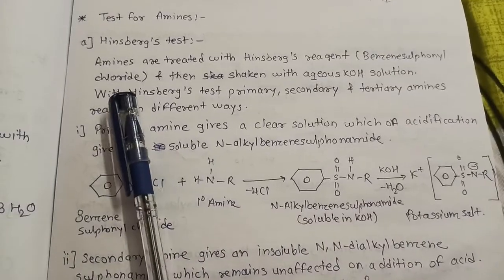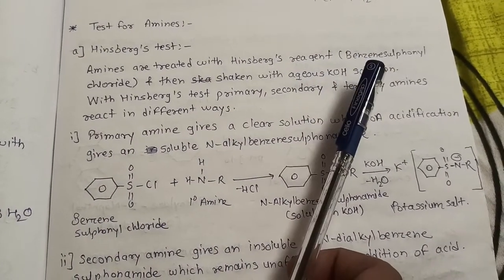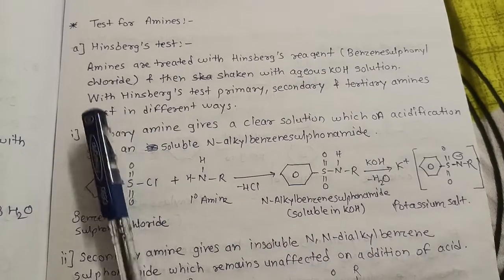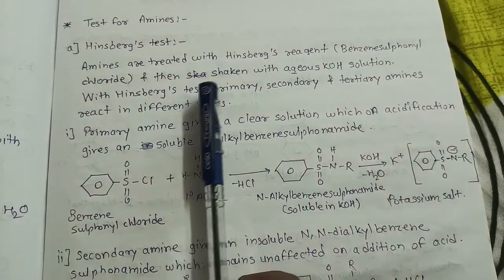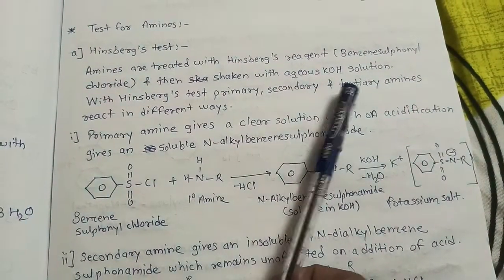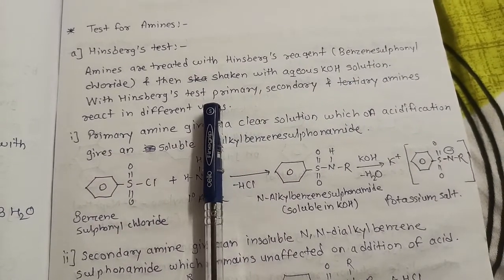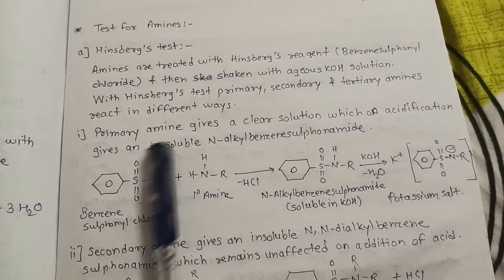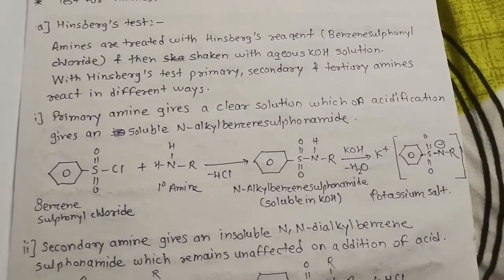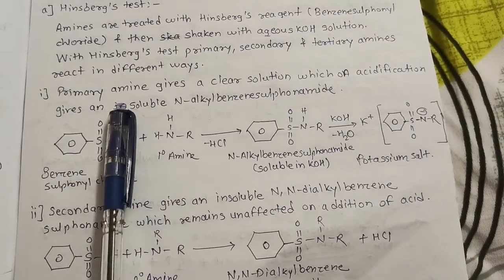In Hinsberg test, amines are treated with Hinsberg reagent. Hinsberg reagent is benzene sulfonyl chloride, and after treating amines with that, it is then shaken with aqueous KOH, which is a strong base. With Hinsberg test, primary, secondary and tertiary amines react in different ways. So by using Hinsberg test, we can distinguish between primary, secondary and tertiary amines. So let's see the reaction for primary amine.